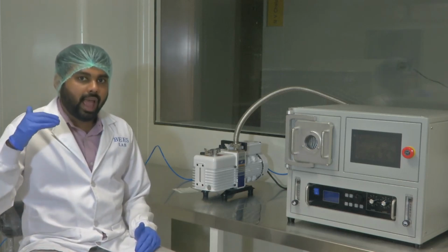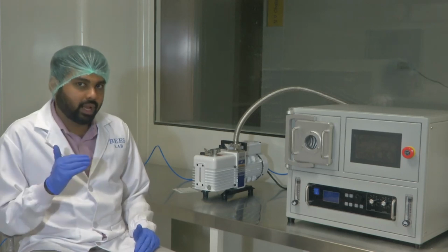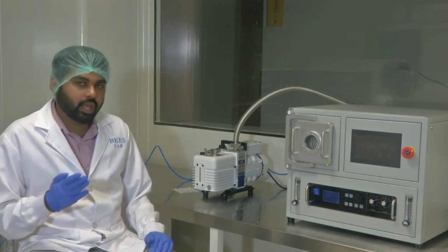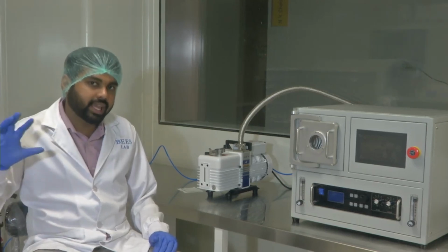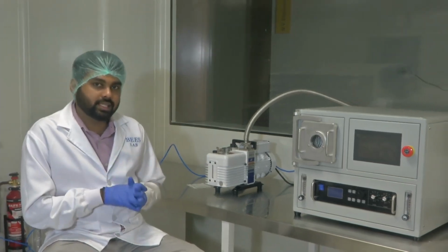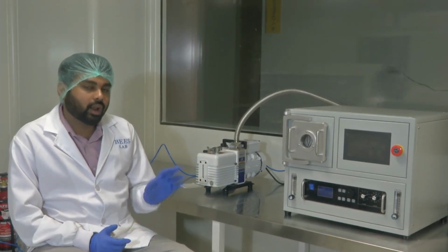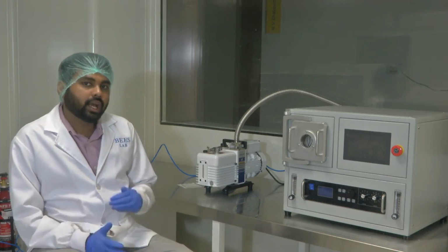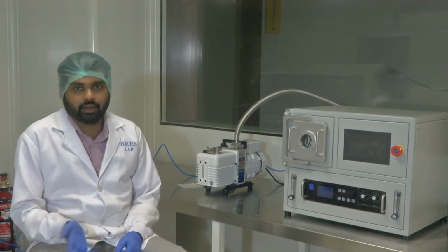As you know, higher energy is towards the ultraviolet range, E = hc/lambda. So when lambda is less, the energy is more. If you take the visible light, your red is towards the infrared spectrum, which is higher wavelength, and your ultraviolet spectrum, which is to the left of your visible spectrum, is the higher energy, lower wavelength range. That is why oxygen plasma is pinkish in color; it is more towards the bluish region than the red region because it is of a little bit higher energy. So if you take another material and make a plasma out of it, it will have its own characteristic color.